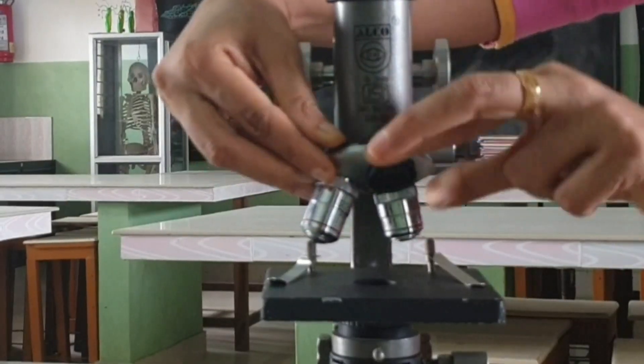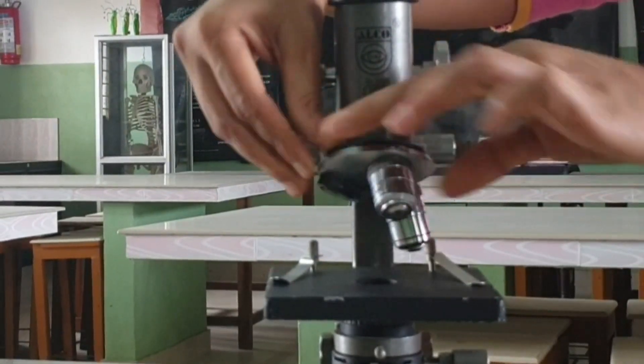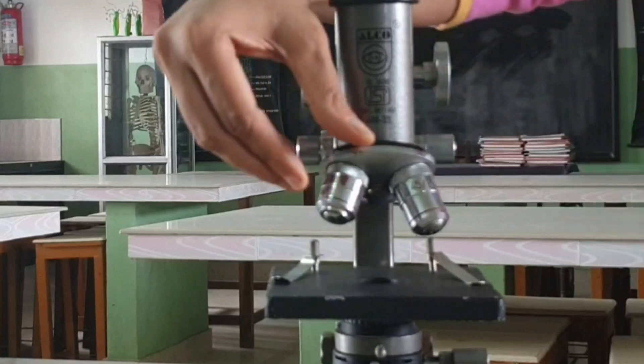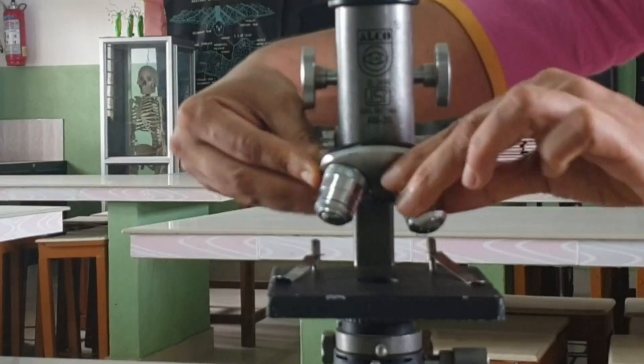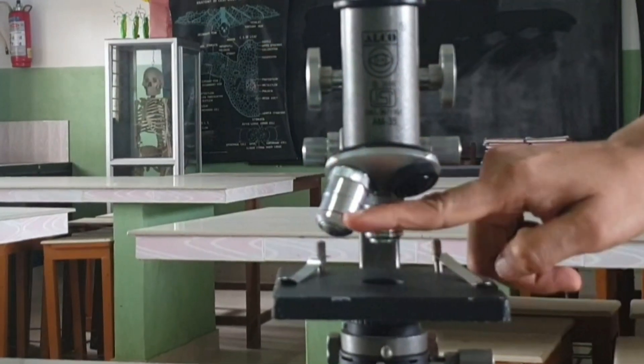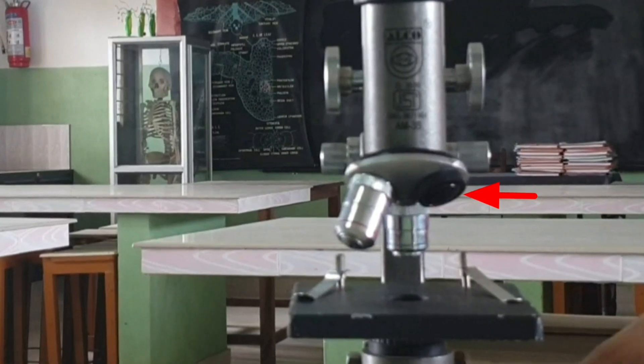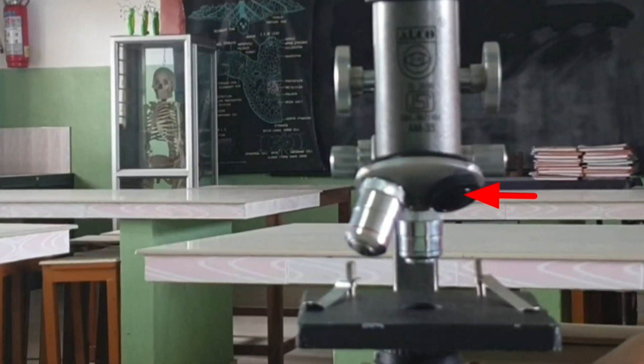Nose piece: it is a circular metallic structure attached below the body tube. Three different objective lenses can be fitted into it. Usually two objective lenses are seen with high power and low power. A provision for a third objective lens is also seen in the nose piece.